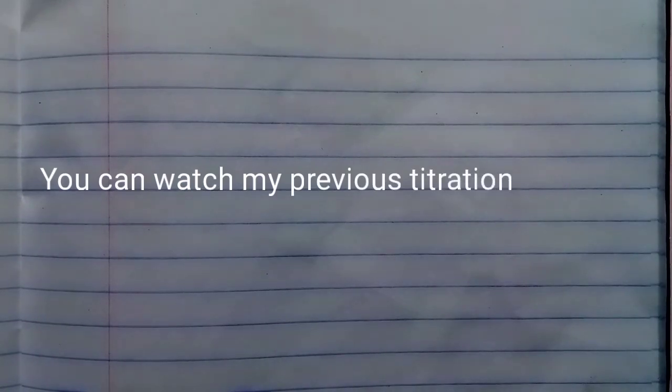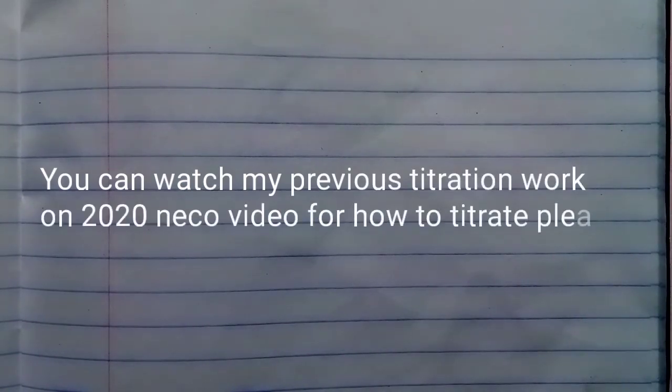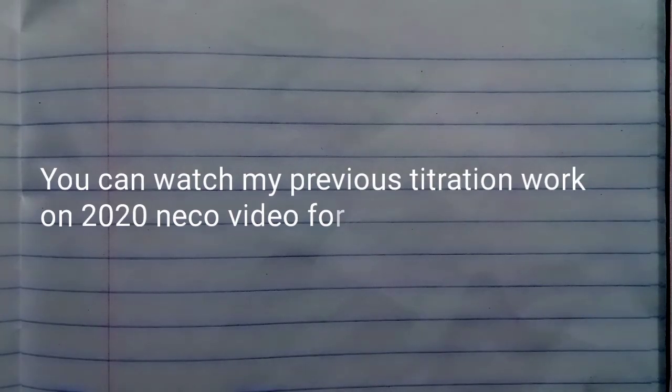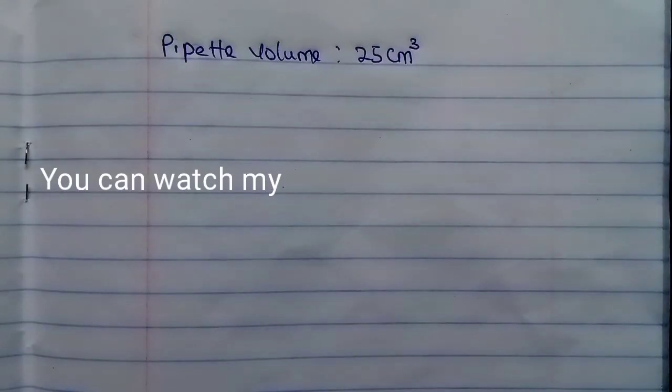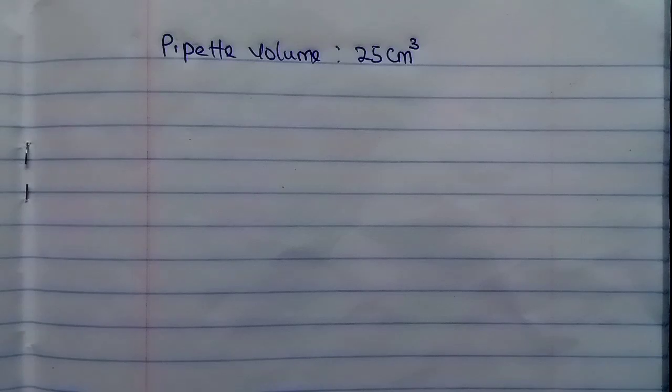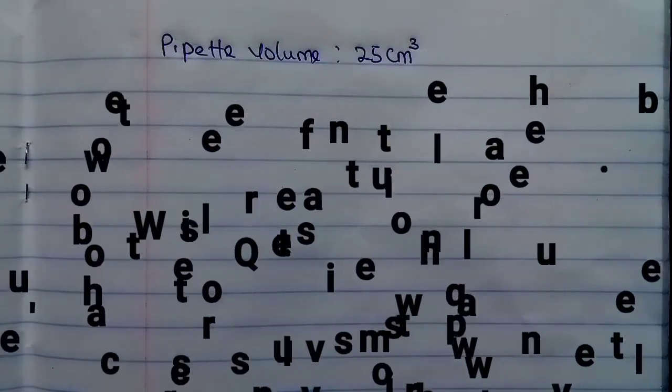After you have done your titration, the next thing that you should do is to calculate the average volume. But before that, I need to help you to understand how to present your table. Look at it as I do it gradually. We will have pipette volume used is 25 cm³. Your school might be using 20 cm³, but I believe that most schools are using 25 cm³.